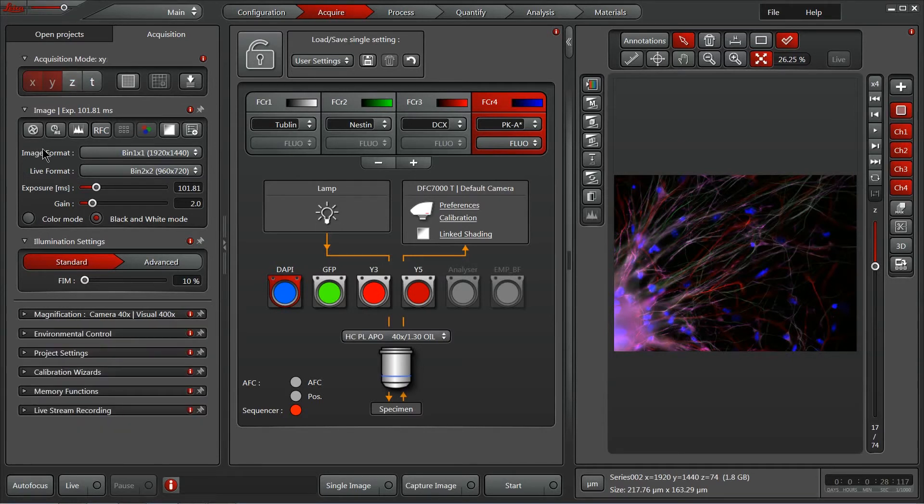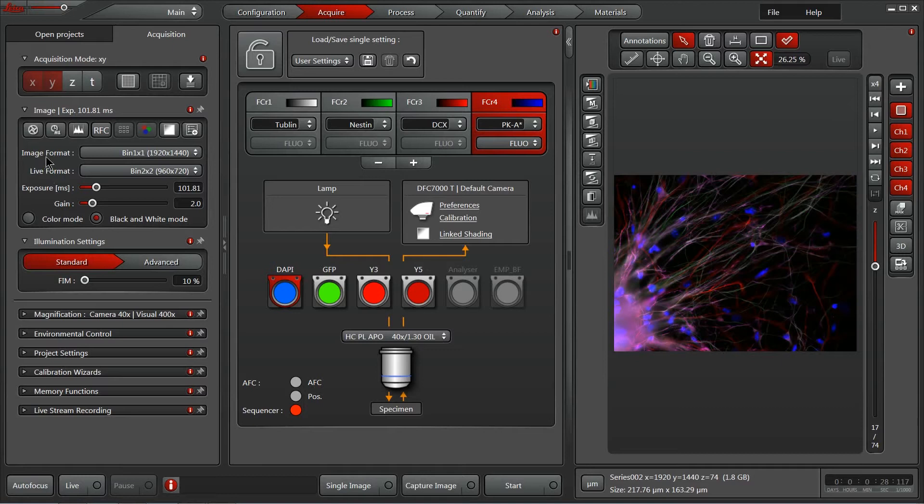Beneath that, we have our imaging control window, where our camera's exposure time, gain, and settings can all be accessed. These can be either identical across multiple channels, or customized for each of the channels that you've set up.